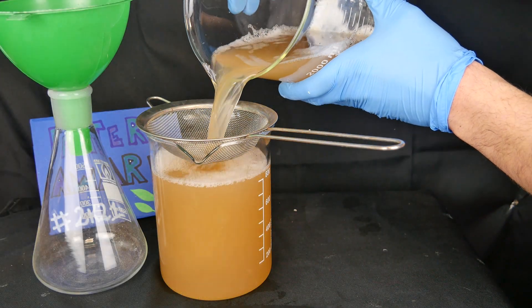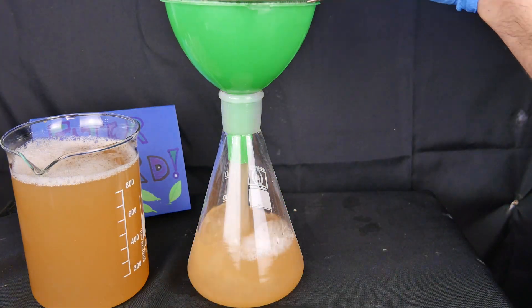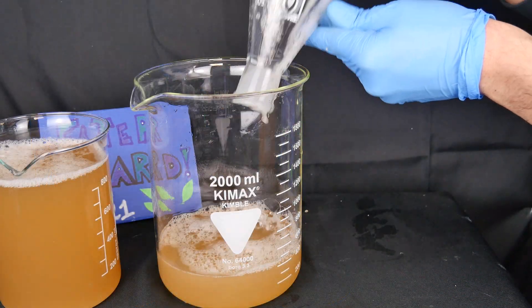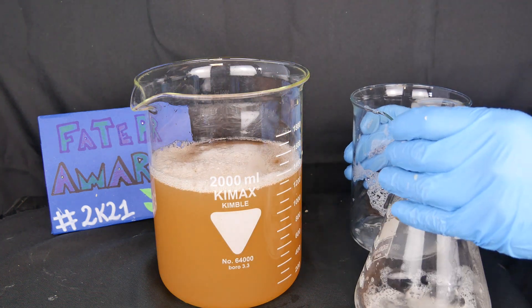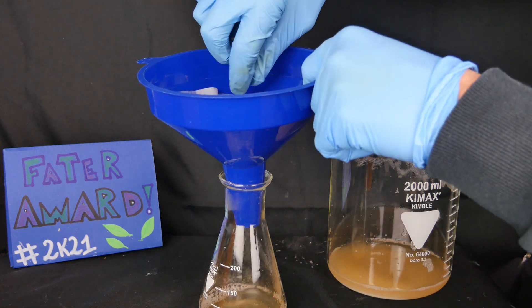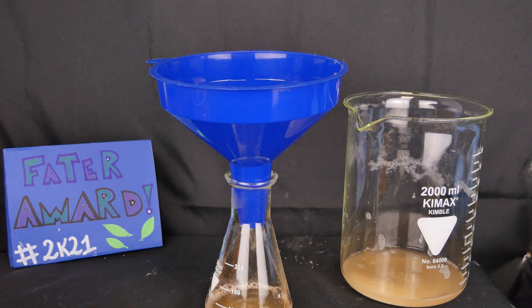We then filter out the solid pieces of potato that may have remained inside the solution through a coarse filter. We gather the filtered liquid inside a single beaker in order to proceed with the finest filtration. For this purpose we will use filter paper, in order to block even the starch present in suspension and to recover it with maximum efficiency.